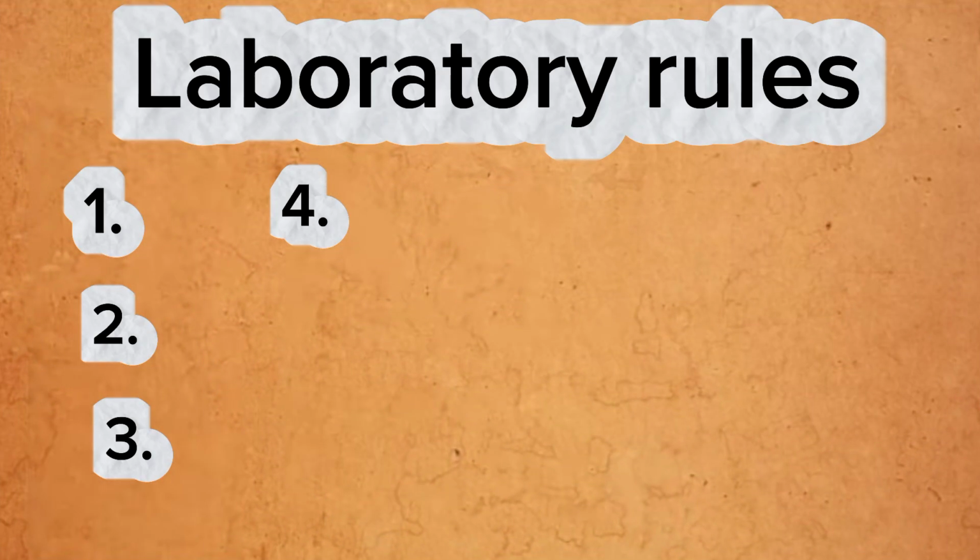Hakikisha kwamba umevaa vizuri. Do not eat, drink or taste anything while in the laboratory. Usiende pale laboratory na ngumu, tena uko na some maybe sweets in your mouth, unachiwa hapo ndani. Hapana, don't do that. Don't chew, don't eat, don't taste anything while in the laboratory. Wacha ni test hii kitu nisikie na test aje. Wacha teacher anazungumzianga kuhusu ethanol, wacha ni test ethanol nisikie inaonjangaje. My friend, utapata una ulimi.